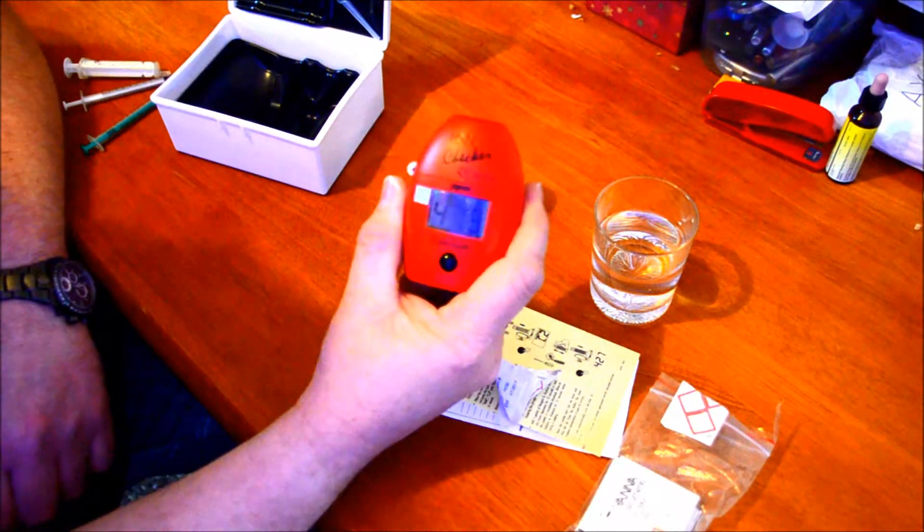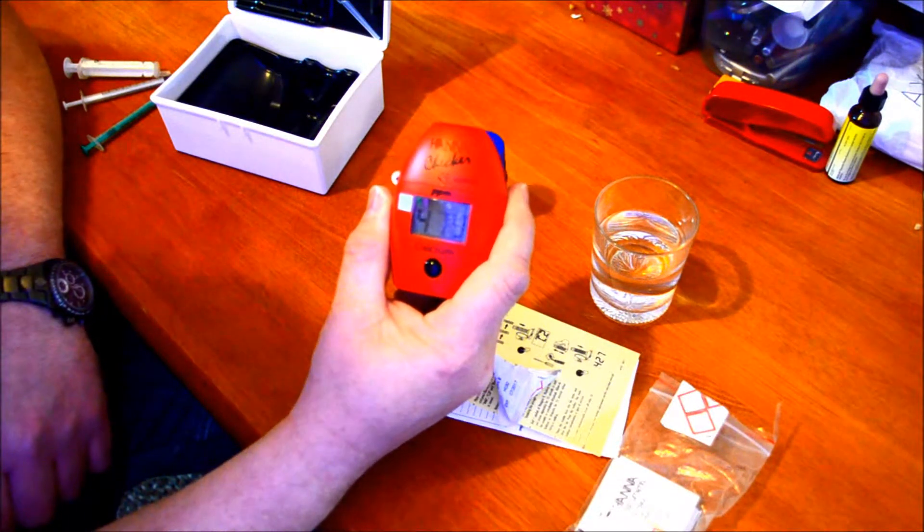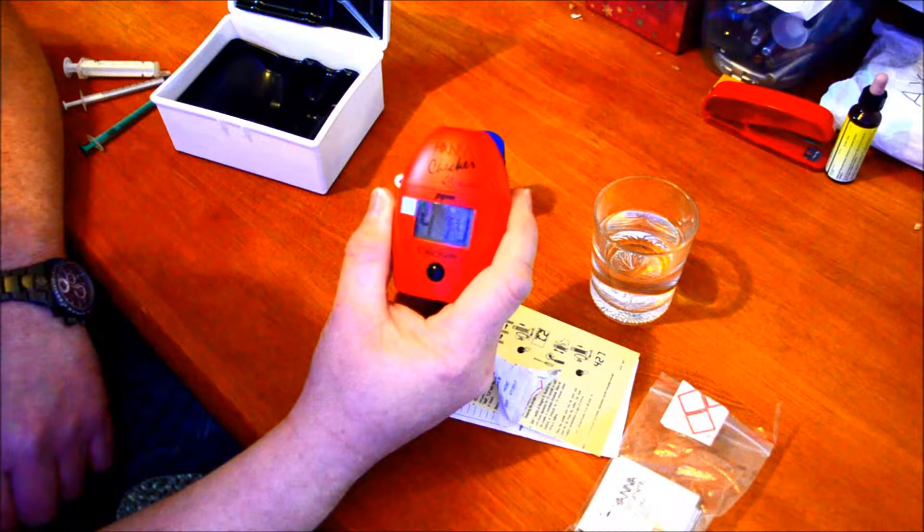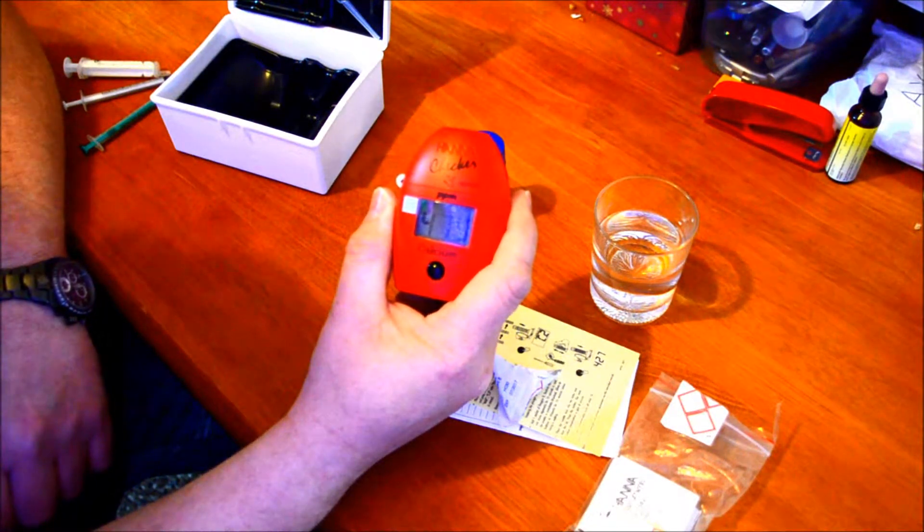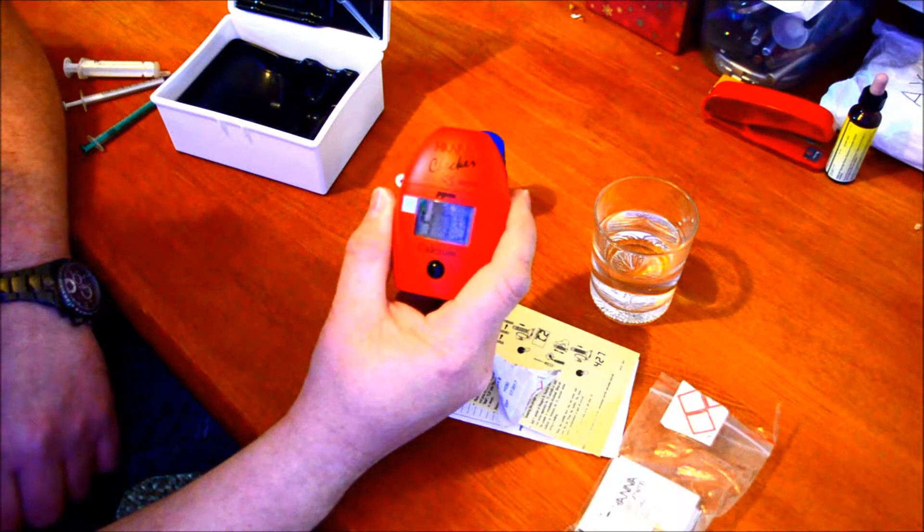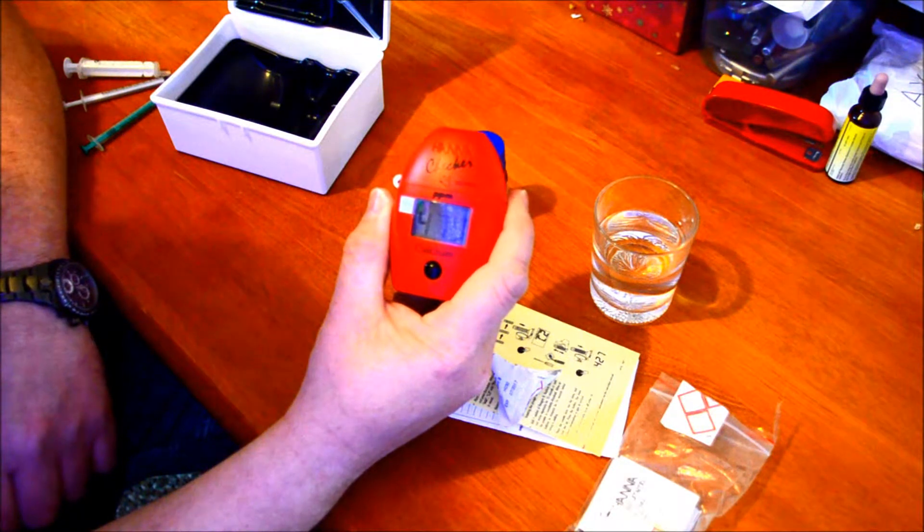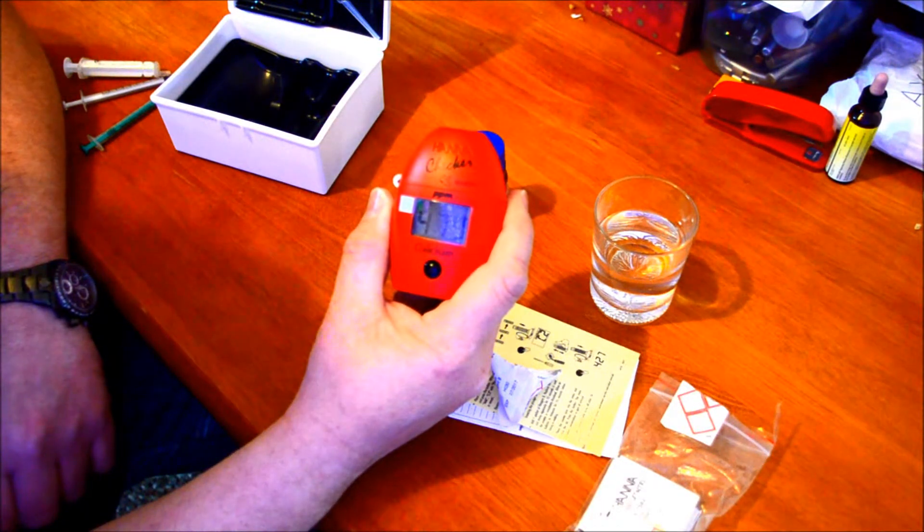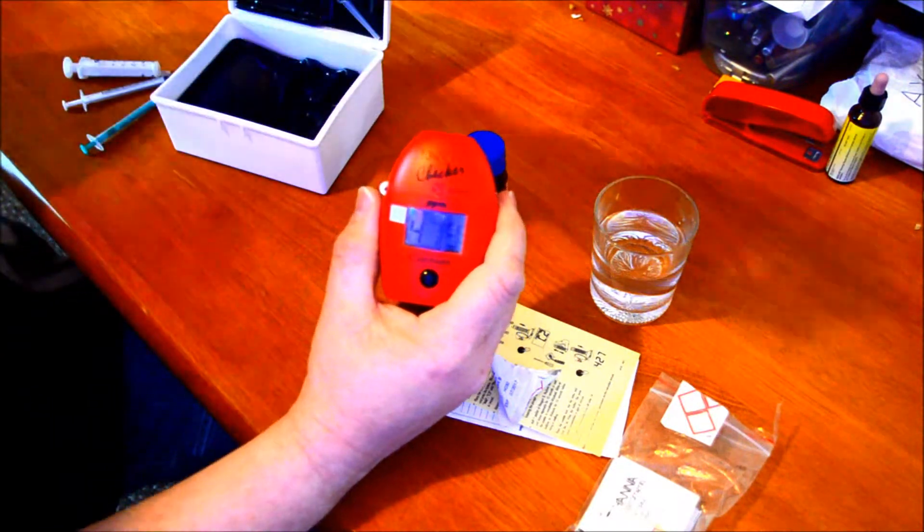As you can see, I've got a calcium reading of 479, which I'm quite happy with. So obviously my dosing and everything else seems to be keeping the calcium at a decent level. I also have a Hannah checker alkalinity one, which I will do a video on after this one. So that's it for now, laters.